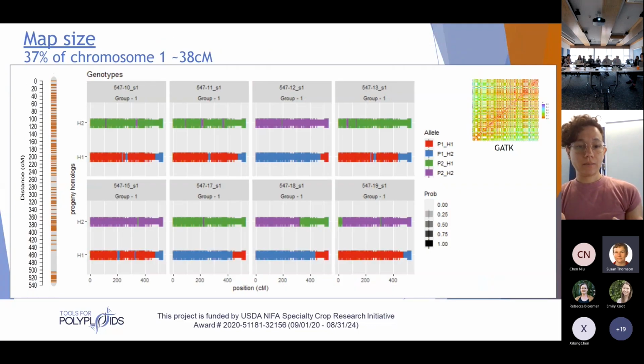And sometimes, even if I have a good recombination fraction matrix, I can have inflated maps, as I told before, because the genotyping errors are still there. I can see that I don't expect this amount of breaks in the haplotypes that I'm estimating with the linkage maps.